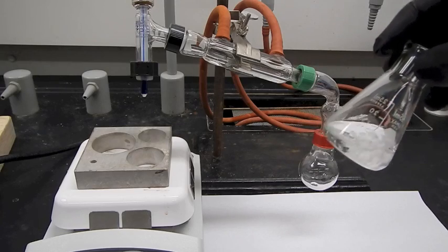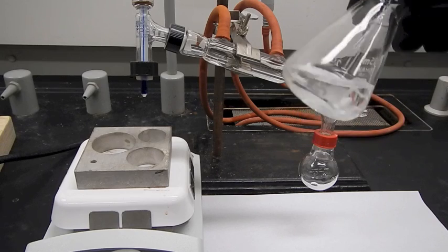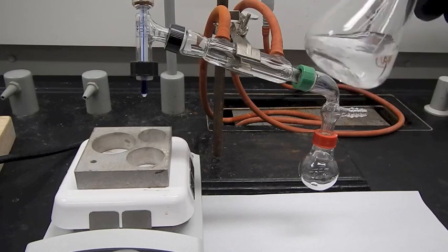So it's been about 10 minutes while I set up my distillation apparatus, and I've got my crude product here. And it's clear now, so the drying agent has cleared up my solution. It's colorless, I can see through it, it's transparent.